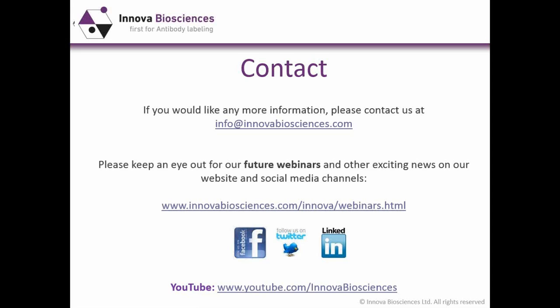Thanks for that question. Indeed, there are some applications in which unpurified antibodies give very good results. For example, cell culture supernatant may be used in immunohistology staining and is very effective.